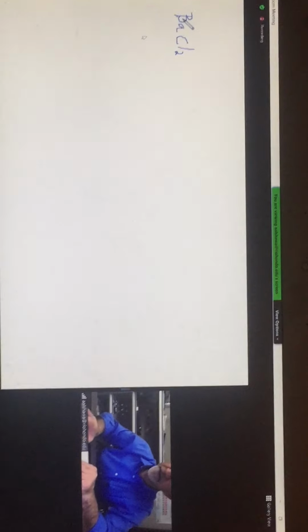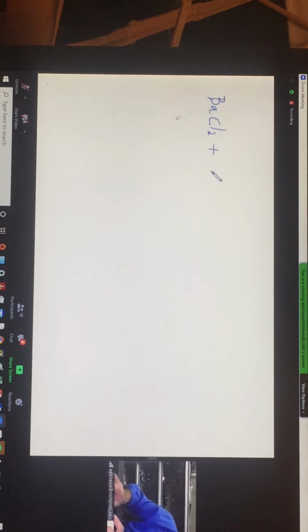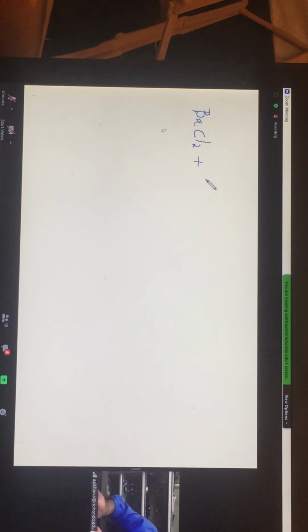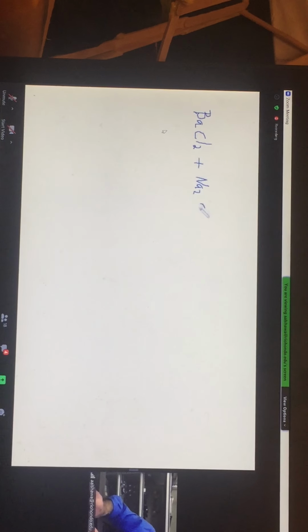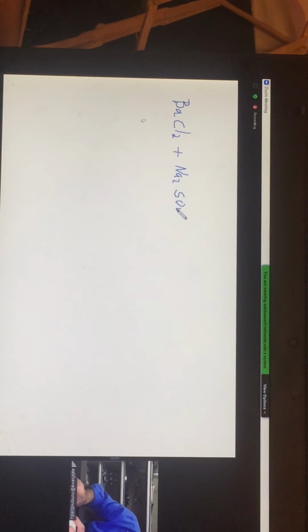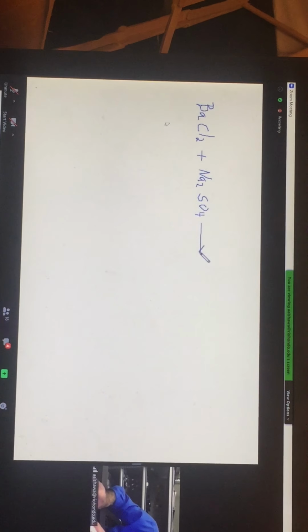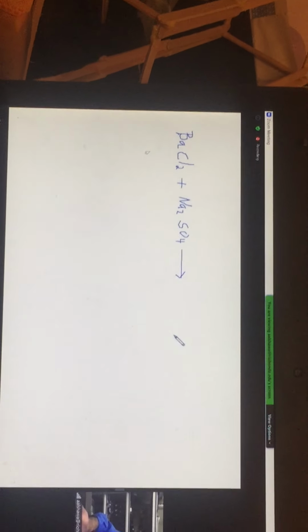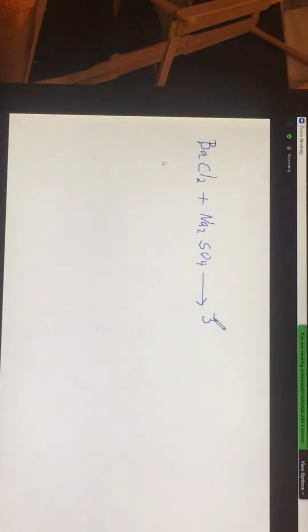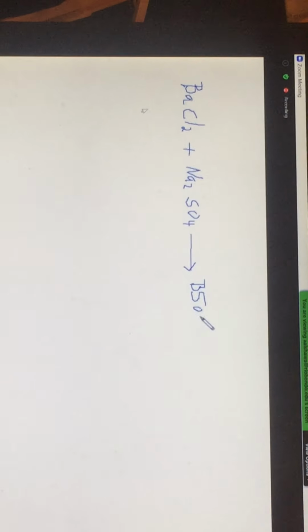Why is it so positive in case of, let's say, sodium sulfate? Remember? So I've added that barium chloride and I call that test the barium chloride test. So that has been added to the sodium sulfate. Let's see how that test is positive. If this is positive, it means there's an outcome, there's a product, and that product does not resemble any of these 2 reactants. And that product turns out to be barium sulfate. Barium sulfate is a snow white solid.